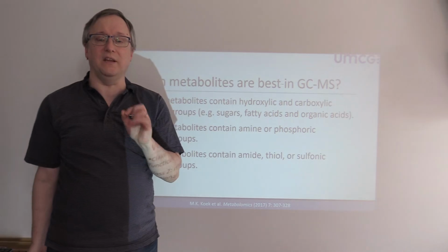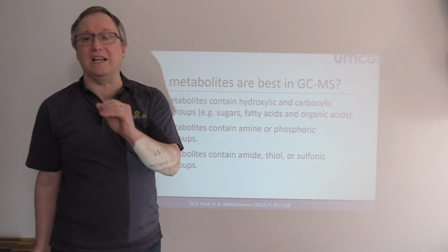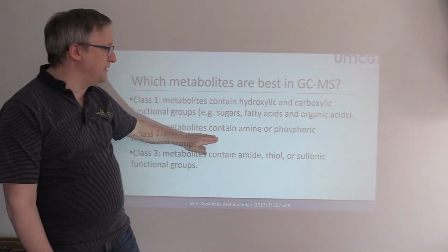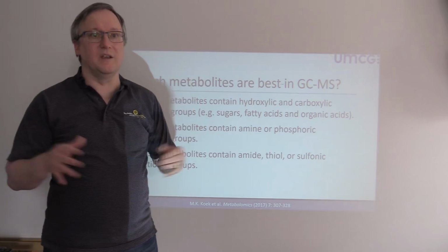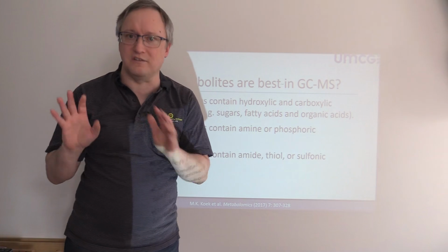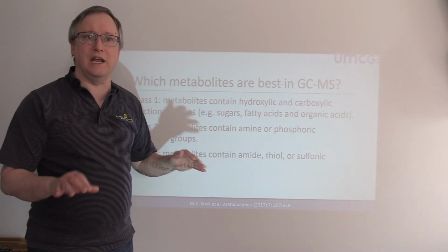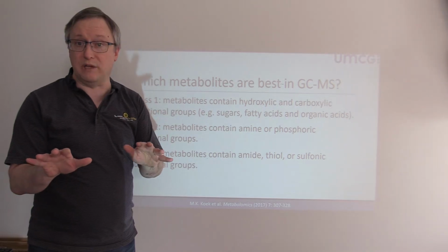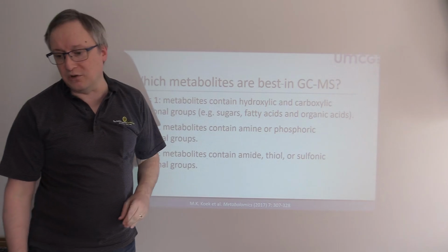And yet, if your method is being a little fussy with you, the molecules you're first likely to detect those problems in will be this class 2, not class 1. The class 1 ions, generally, so long as the moon is not in the incorrect phase, are going to work. But once we get to class 2, things get a little iffier, and you really want everything working properly with your experimental apparatus in order to get good ions from these molecules.